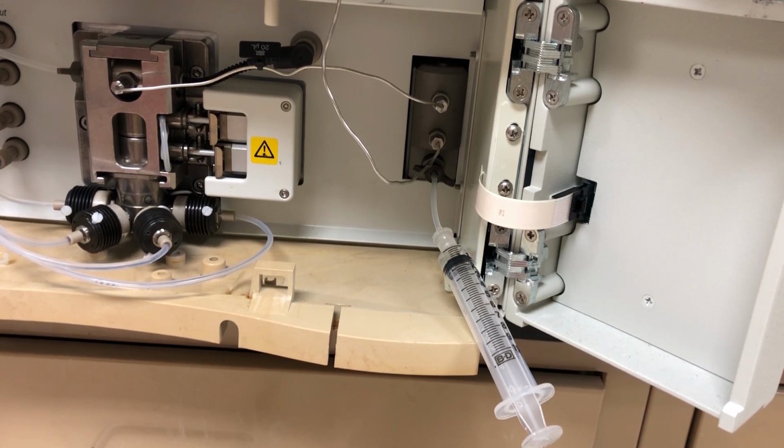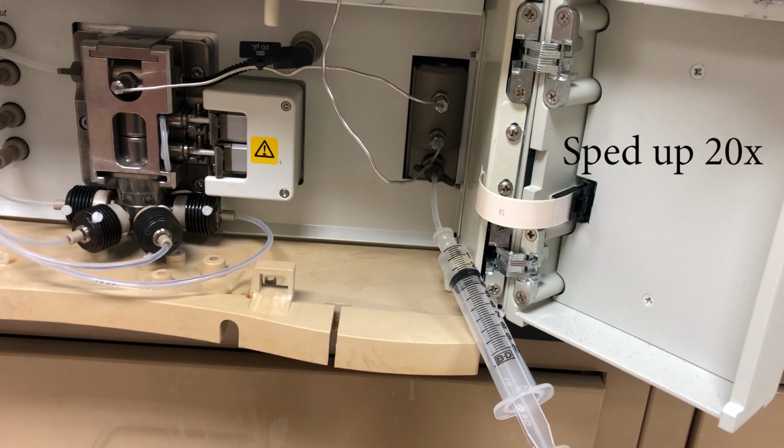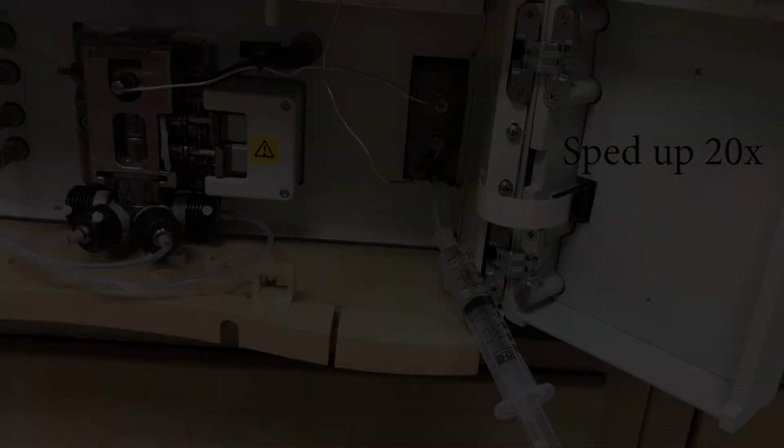These pumps can push against back pressure. Remember, that's one of the main things you're paying for when you pay for an HPLC system, is how much pressure can you put out. So they can push against back pressure, and they can actually kind of push this syringe down. So over the course of a couple minutes, this guy should hit 2 mils because it's at 2 mils a minute. So if we cheat and speed this guy up a little because it's boring, you can see it fills up the syringe pretty quick.